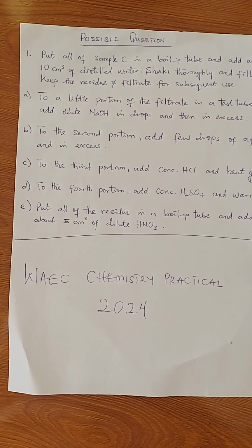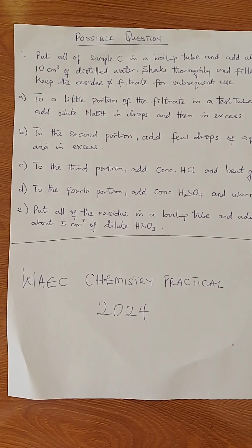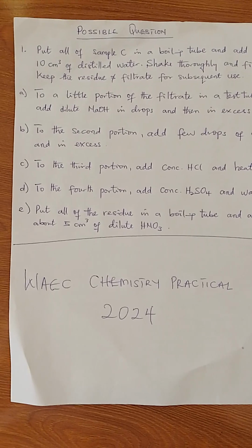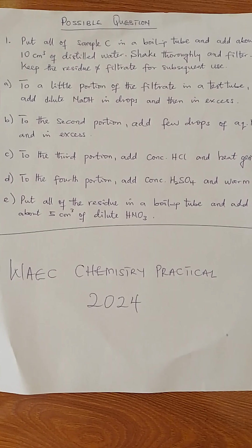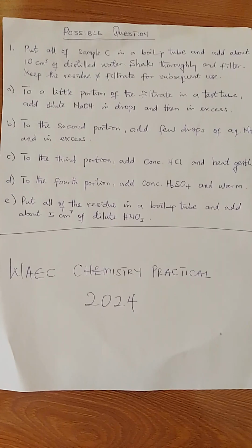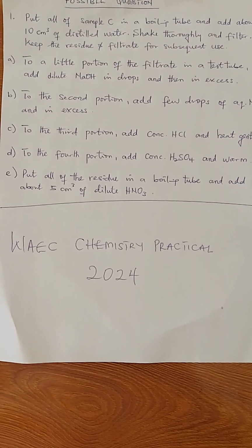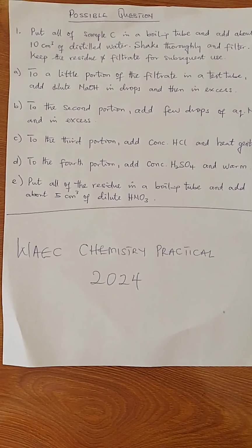A. To a little portion of the filtrate in a test tube, add dilute sodium hydroxide in drops and then in excess. B. To the second portion, add a few drops of aqueous ammonia in drops and in excess. C. To the third portion, add concentrated hydrochloric acid and heat gently. D. To the fourth portion, add concentrated H2SO4 and warm.